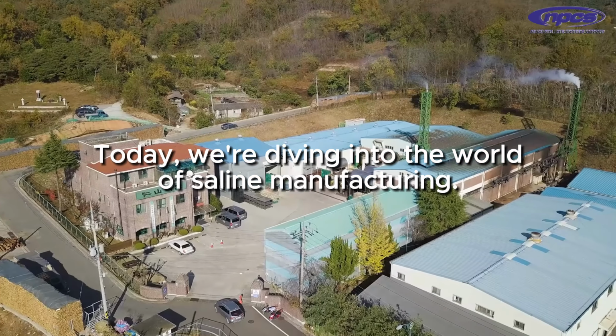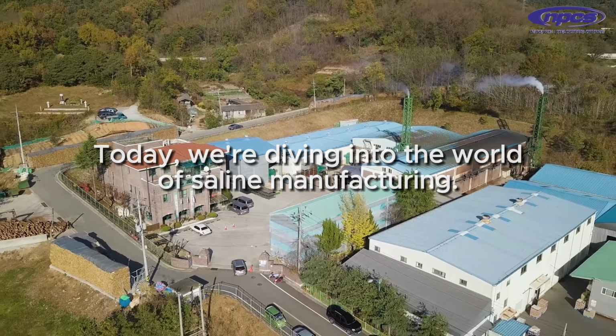Today, we are diving into the world of saline manufacturing. If you're an entrepreneur looking for a promising business opportunity in the healthcare sector, this video is for you. We'll explore why and how to set up a saline, intravenous fluid solution, manufacturing business, covering everything from market demand to machinery requirements.